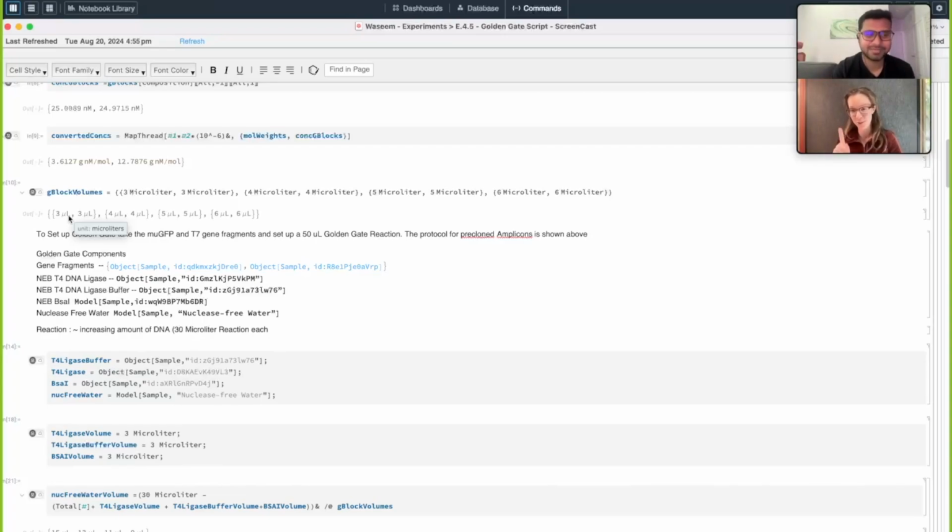So it's worth really putting a flag on: small volumes are tough and need to be optimized. One more thing I want to mention is that previously I was using 20 microliters of total reaction. Instead, I have upped that volume to 30 microliters in this case to make sure that there was enough volume of each component that I'm adding to the reaction. Hopefully that makes sense.